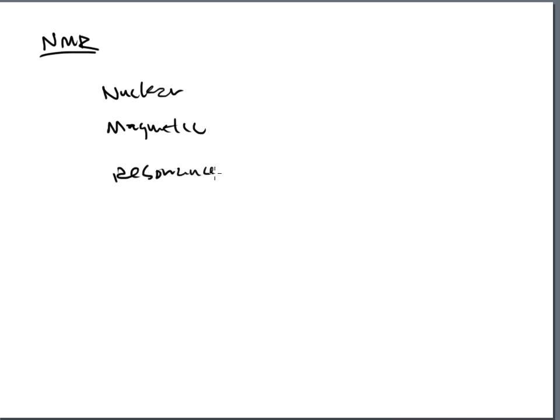So before we go into the interpretation, I need to give you a little background about NMR. First, NMR. Let's start with that abbreviation. We already know that this means nuclear magnetic resonance. So let's break down these terms and get our head around this concept of NMR. What is it doing? What is it focused on?